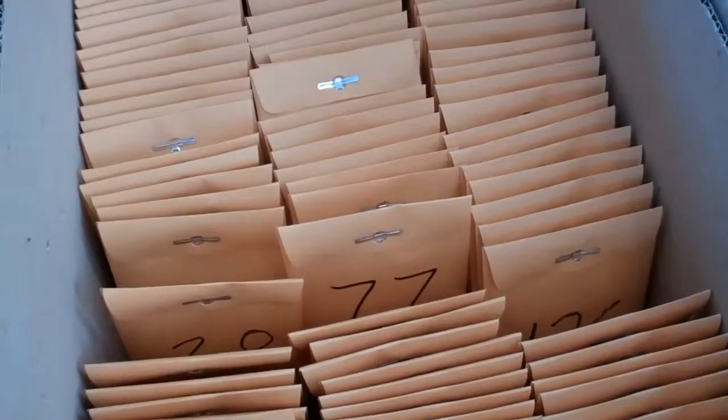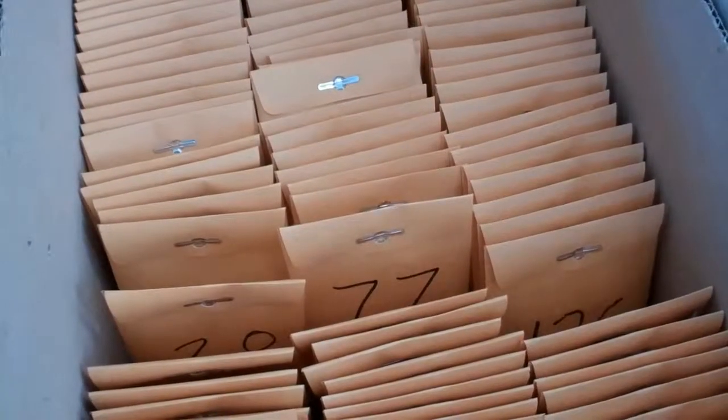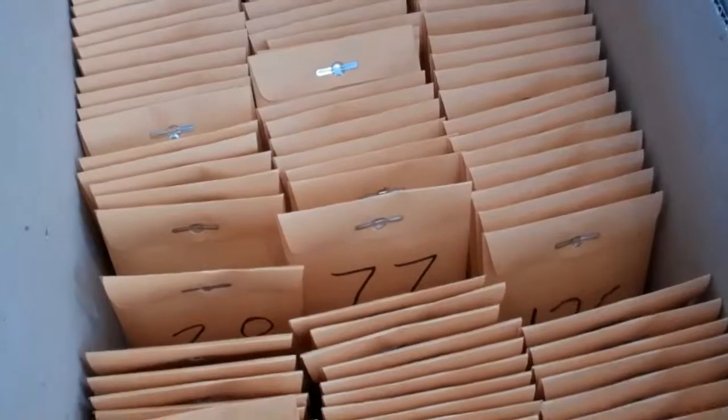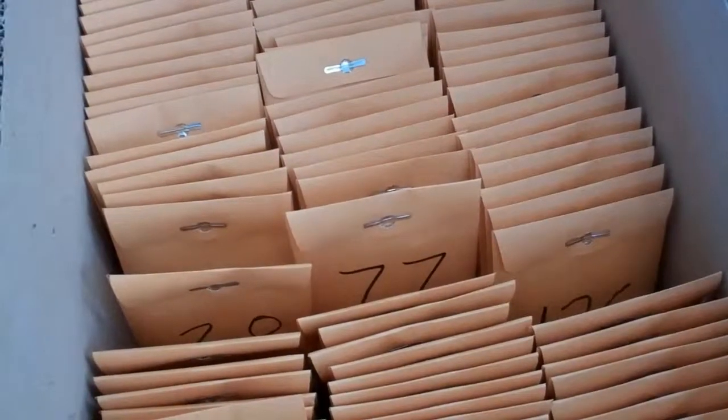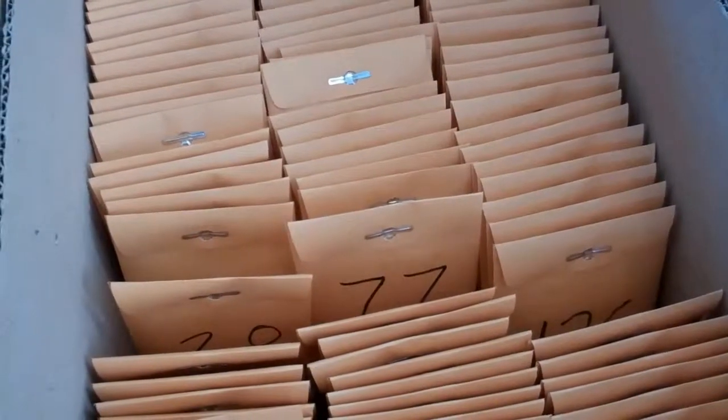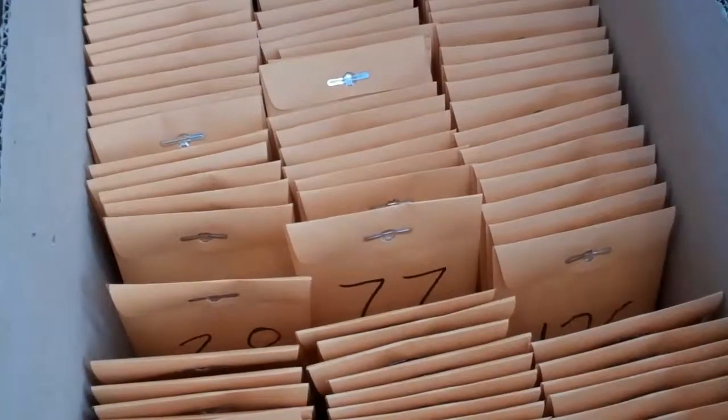Germ testing helps us figure out which of the ears are actually fully mature and are ready to go in the spring. This little video will show how we can do germination tests in our homes with a large number of ears.